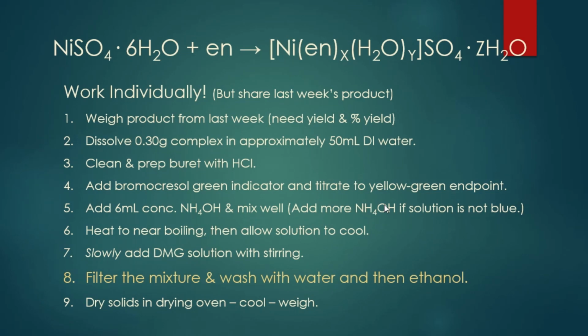We want to dry that, so once you've filtered it, if you see no more liquid coming down or it looks sort of dry on the top, you can stick it in the drying oven. We've got 2 of them in the labs, and just stick it in the beaker, stick it in the drying oven, and it says to wait 20 minutes.